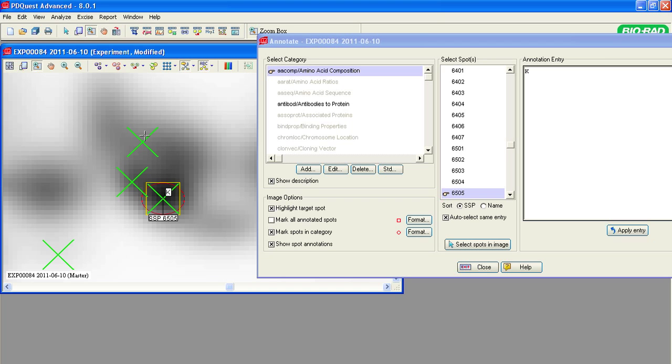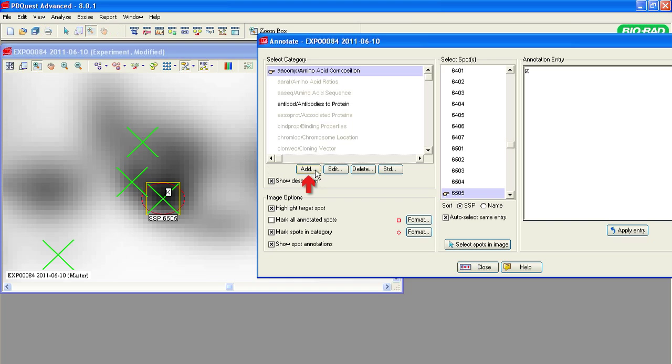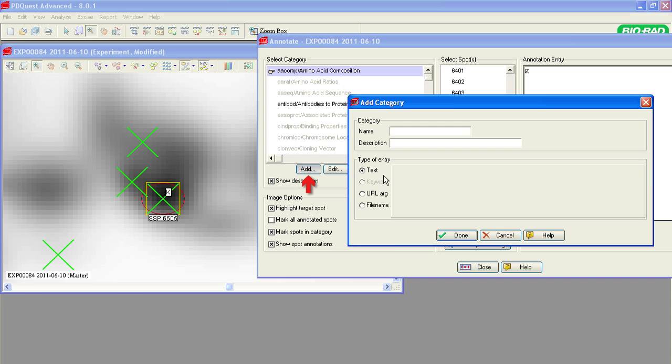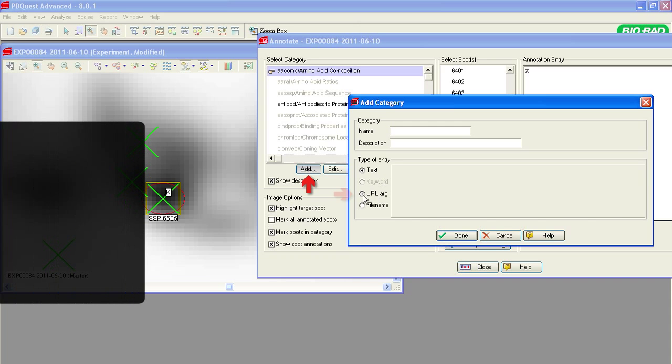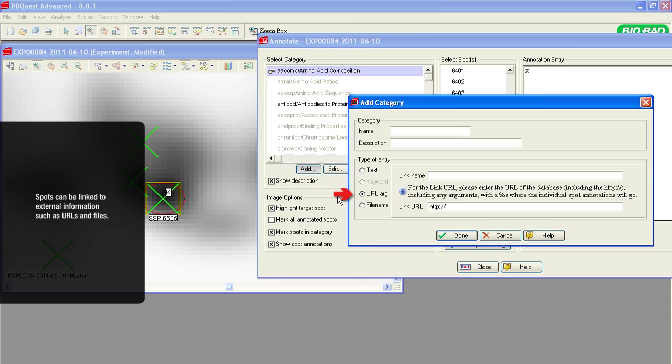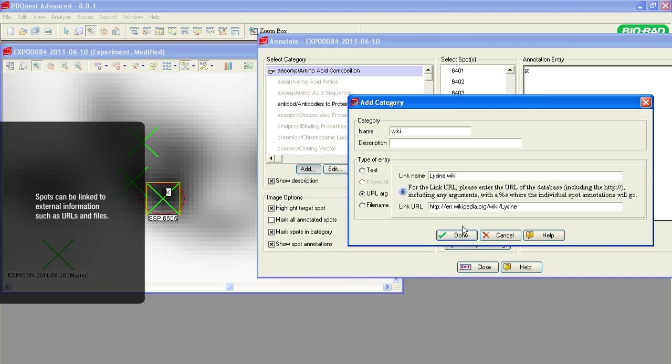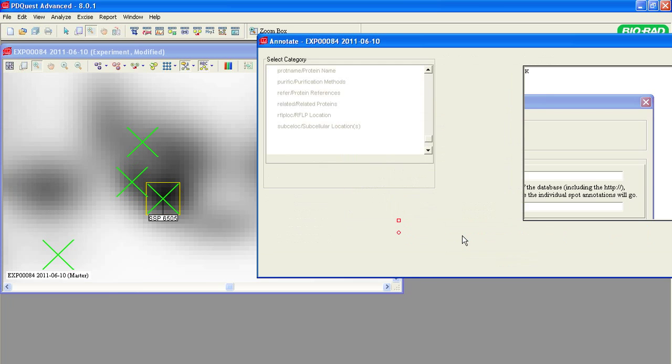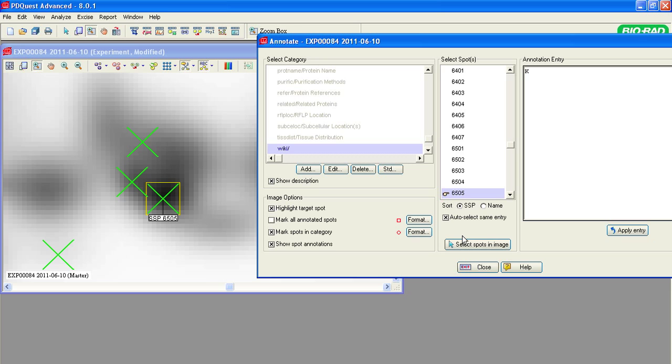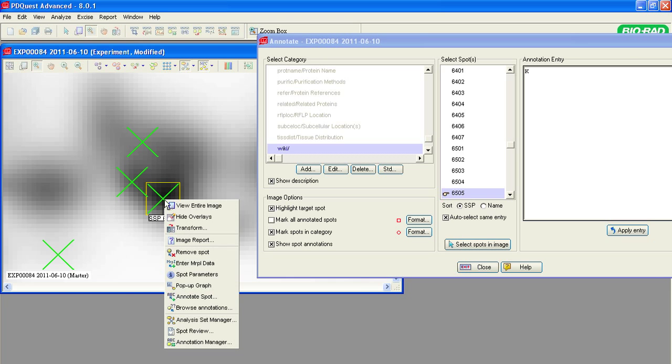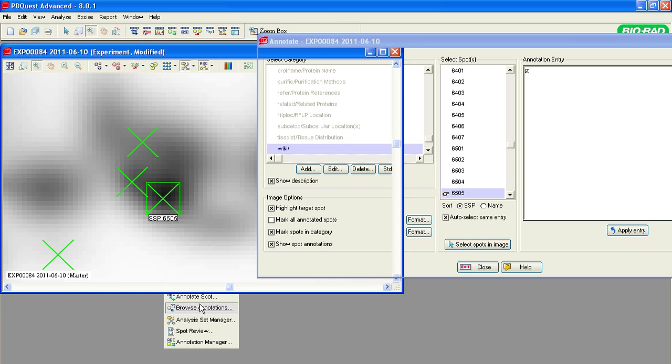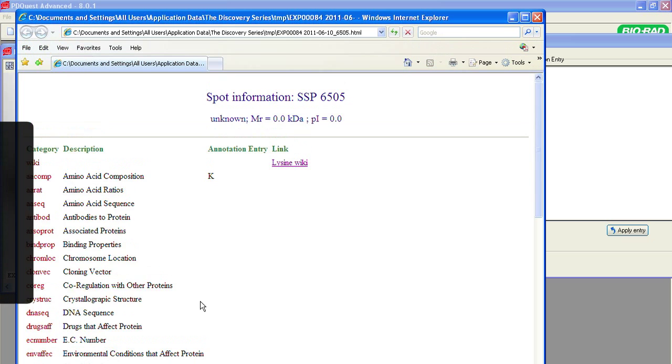To create a new category, click the Add button. You can link external information to the spot annotation, such as URLs and files. To open a URL link, right-click on the spot and select Browse Annotations to open the annotation in a web browser.